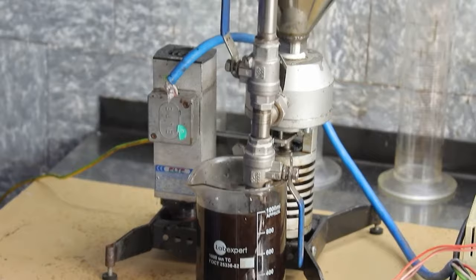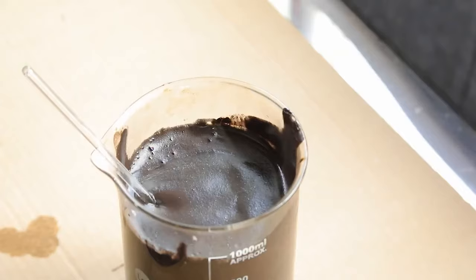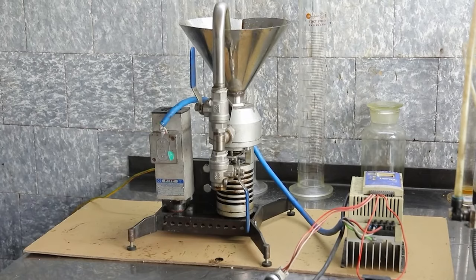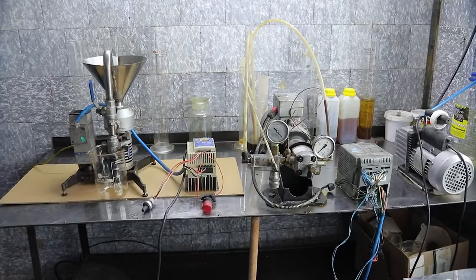This laboratory unit is designed to allow determining the amount of ingredients needed for emulsion production without starting an industrial plant. Using this small unit, we also determine how much acid and how much emulsifier we need. The unit is portable and suitable for any laboratory. Such equipment will be useful at any bitumen facilities.